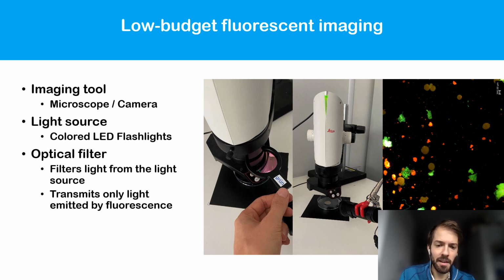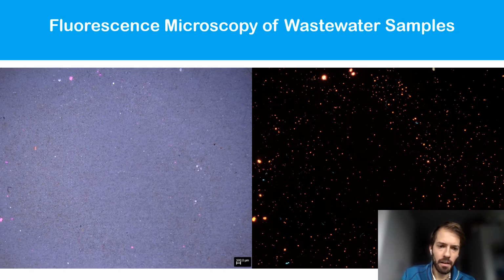And this makes this method widely available because you can transform your microscope to a fluorescent microscope with a low budget. Currently, we are working on a paper where this will be explained in detail.